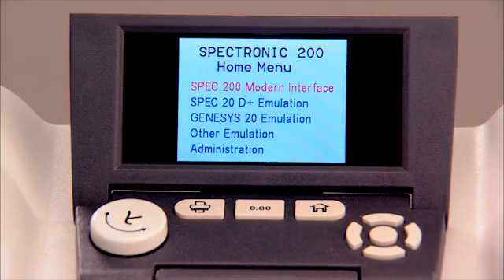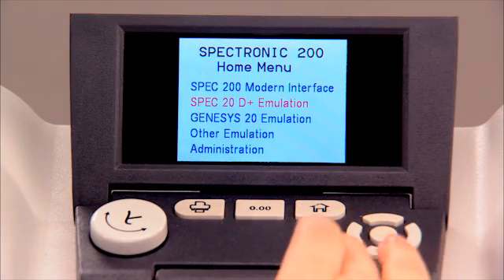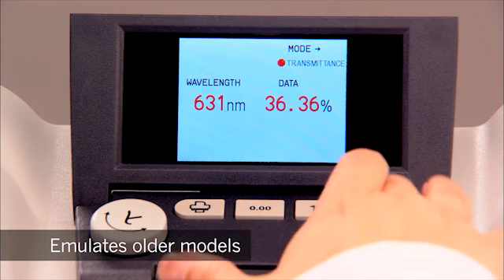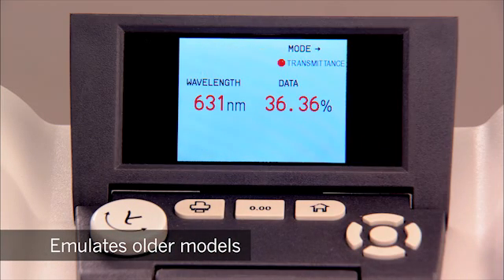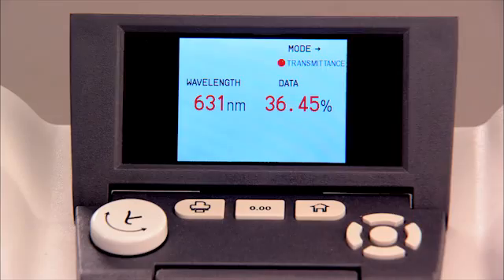If the SPEC 200 shares a lab with older spectrophotometers, it can emulate them so that your students can use the same protocols, no matter which instrument they're working with.